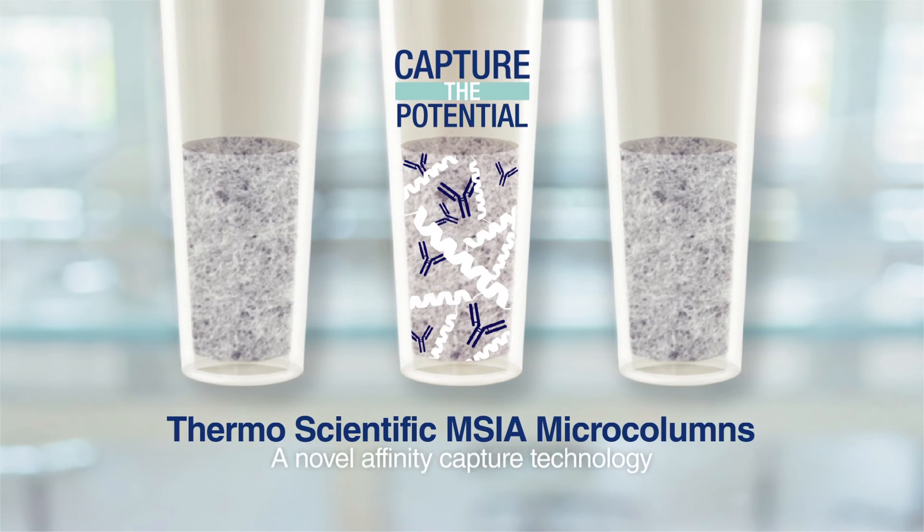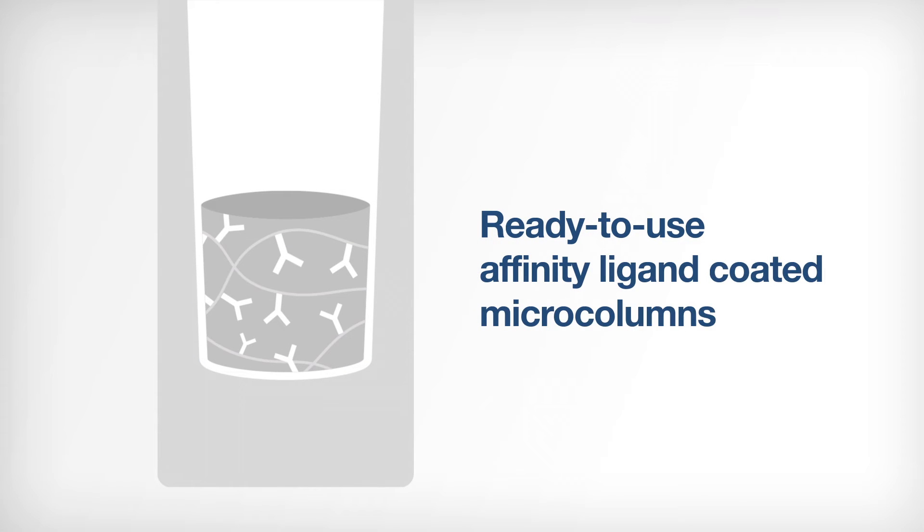Overcome the challenges associated with traditional affinity purification methods with Thermo Scientific MSIA microcolumns. Housed within pipette tips, ready-to-use MSIA microcolumns are coated with target-specific affinity ligands.